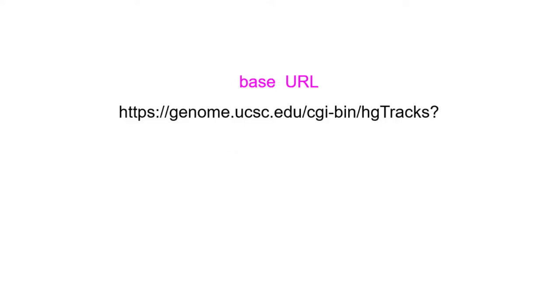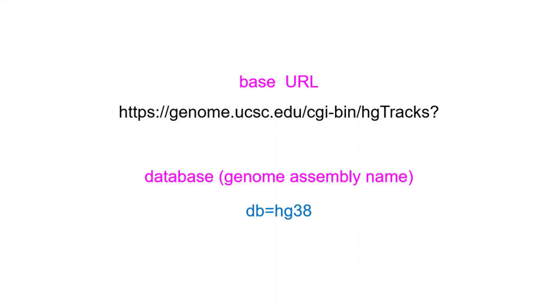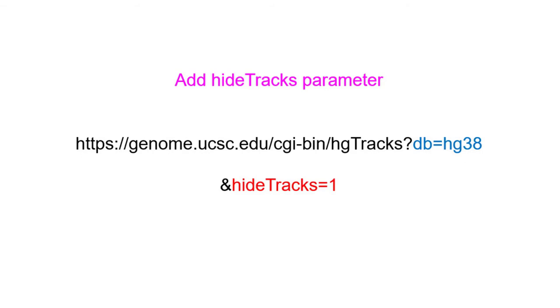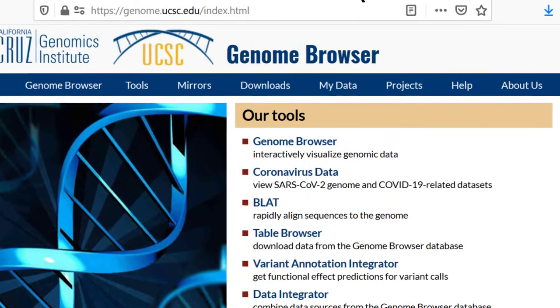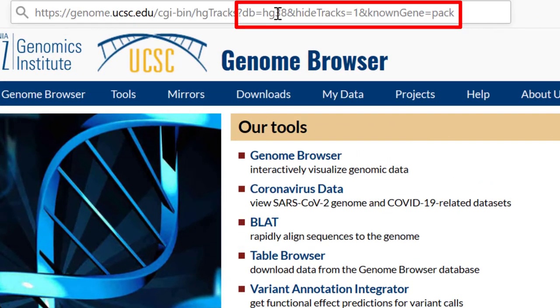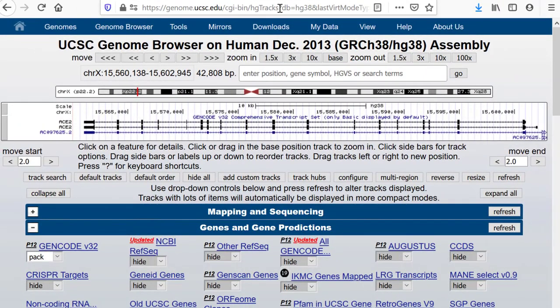Let's start by building a URL using the principles we discussed in Part 1 and jump right into the browser. We'll start with the basic URL, add a database assembly name hg38, turn off all the default tracks with the hide tracks parameter, and turn on the GenCode genes track to pack using the known gene table. Because this URL has no position information, it will go wherever you may have been in the genome before. The next step will be to specify a location.